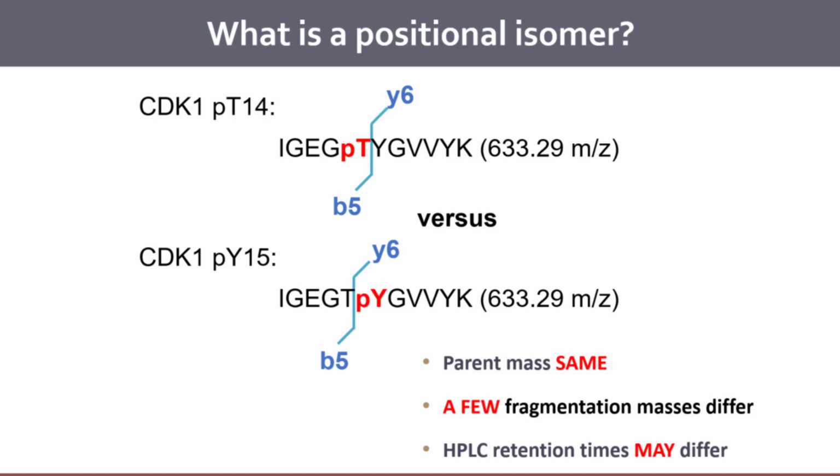There may be a couple of fragment ions that differentiate between them. The retention times may or may not be different. Now, of course, the site of these two phosphorylations actually changes the function quite dramatically.